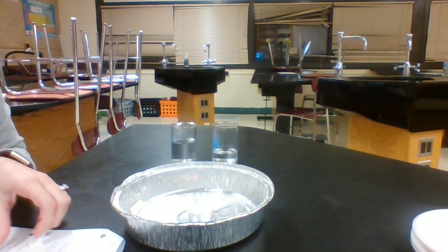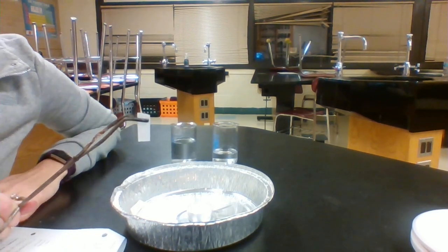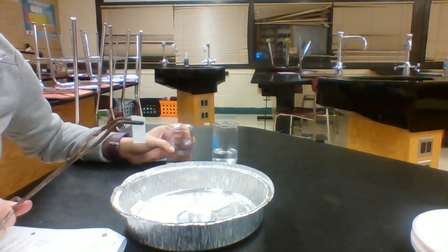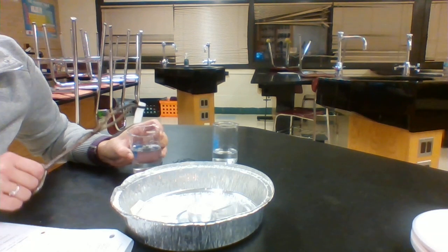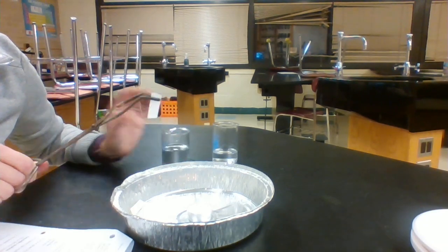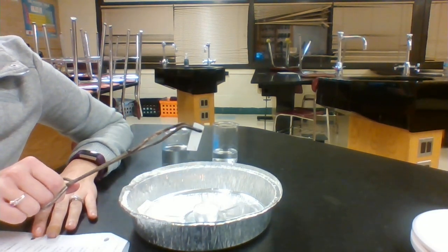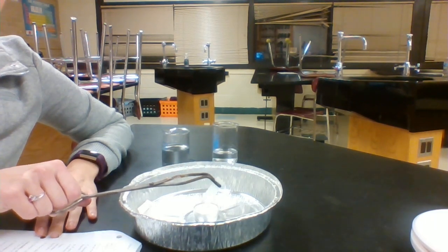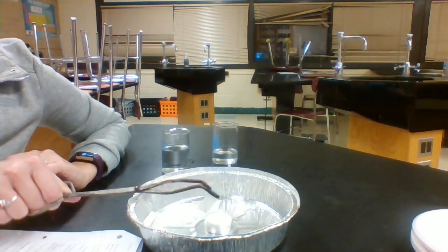The first clear liquid that I'm going to test is going to be my water. So what I'm doing is I'm taking my tongs and I am holding the piece of paper. I'm going to put my paper into my water. I'm going to let it drip over the container. And then I'm going to place it over the flame. And as you can see, nothing is happening. So the paper did not catch on fire.